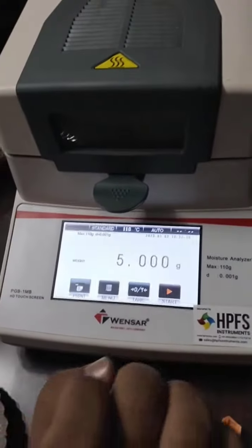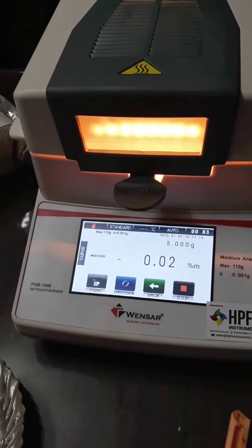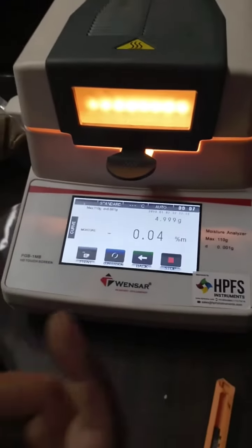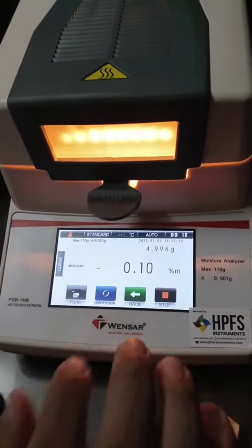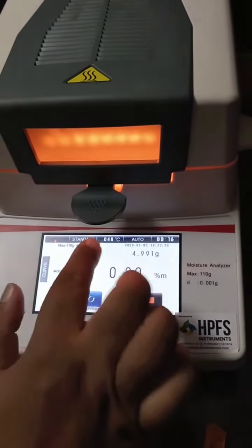I will start with halogen heat up and the exhaust has started. As you can see here, the weight loss will start. We will reach the temperature like 50 degrees.